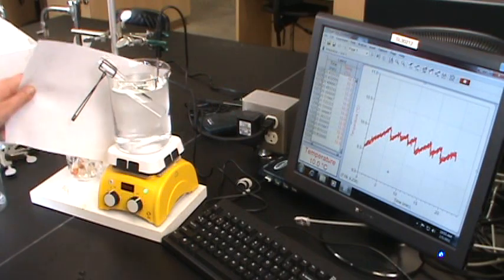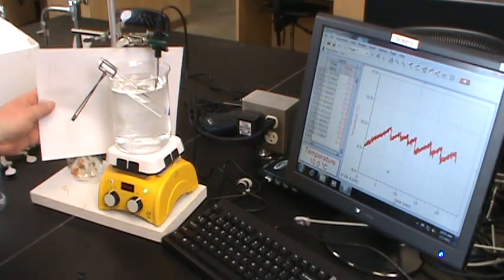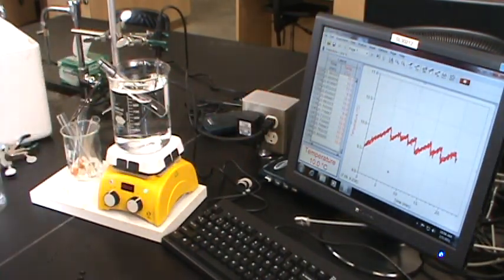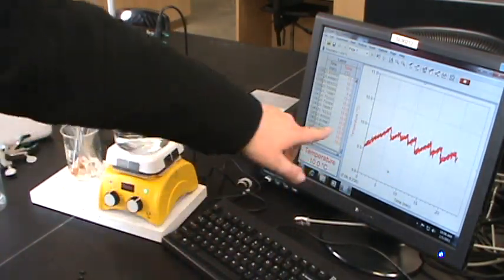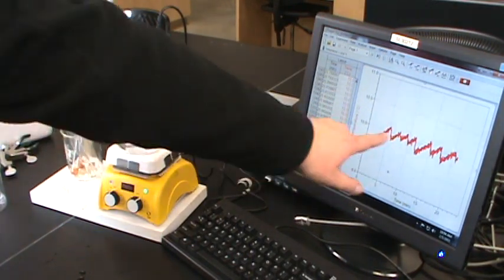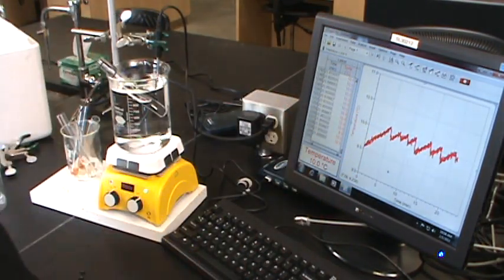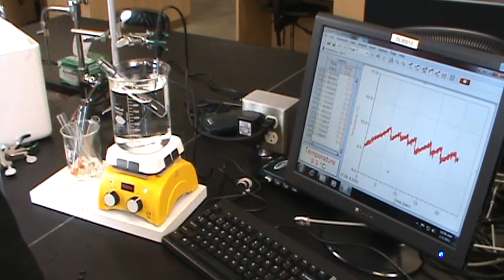So you can see my sample really just turned colorless. So my first run is done. Looking at the data on the screen, yeah, while it was reacting, I had to add ice a few times. And also looking at the data on the screen, I can say that I probably on average was closer to 9.9 degrees Celsius than 10.0. So for this run, I think I'm going to call it 9.9. I'll try to keep it at that same level for the rest of my experiments.